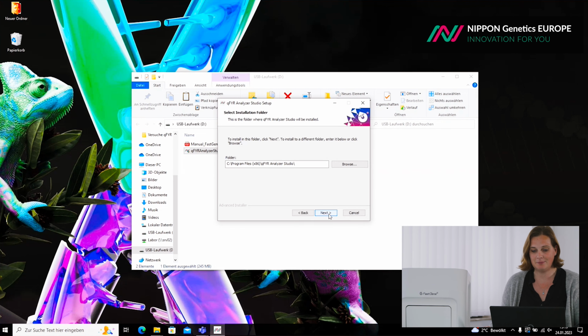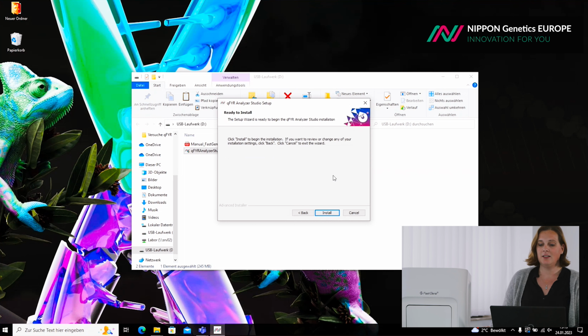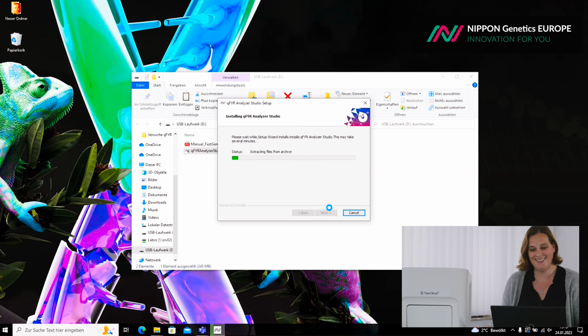Confirm by Next. And then choose a folder and location where to install the software. Confirm by Next. To install, just click Install to start the installation. Wait a few seconds.